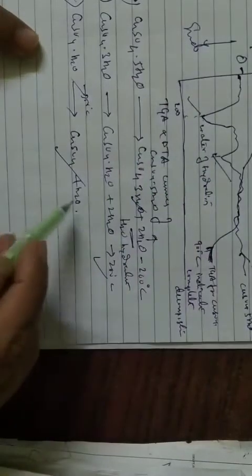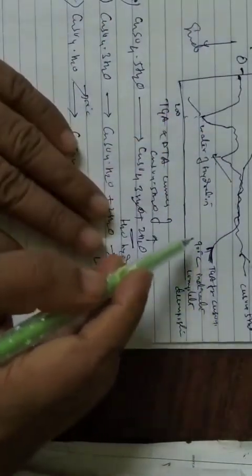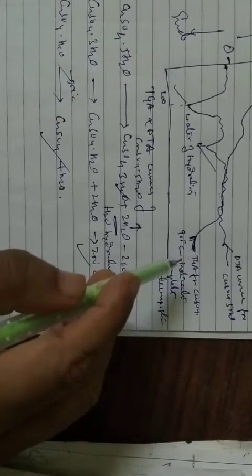So this is what we call water of hydration. These two peaks, and later on if you increase the temperature further, you can see a complete decomposition of this at somewhat higher temperature. So this is the important thing to be learned in this DTA study, okay.